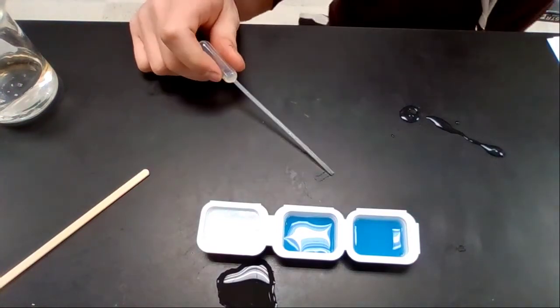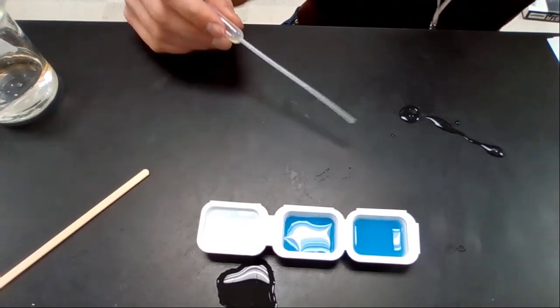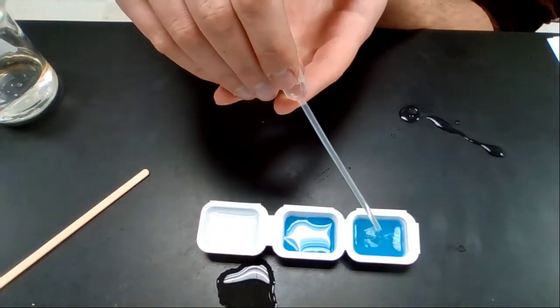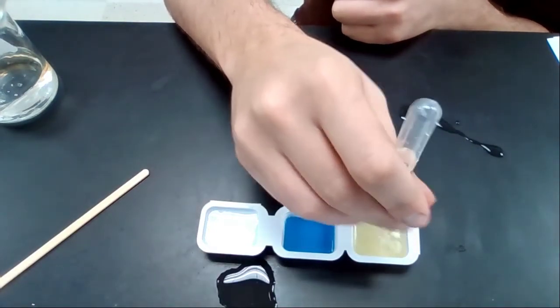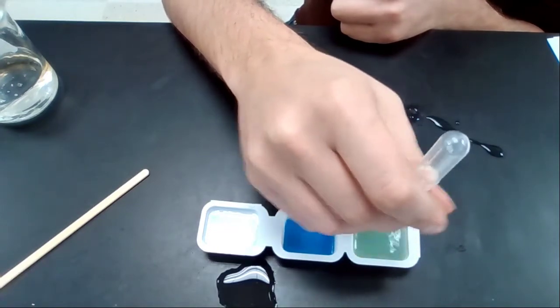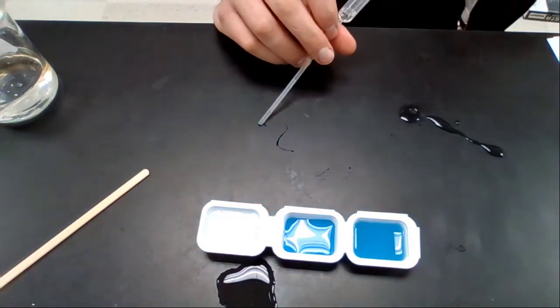So let's go again. It says here for 11, repeat step 9, quickly stir the tip of the pipette. I think I actually put in the whole thing, so again, we'll stir that up. Interesting, isn't it?